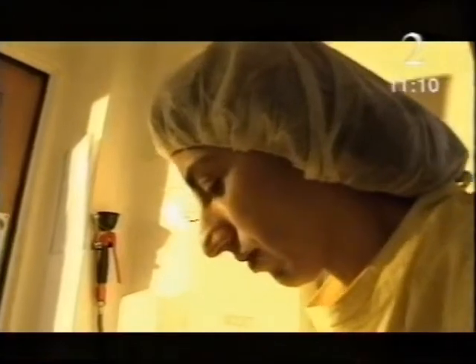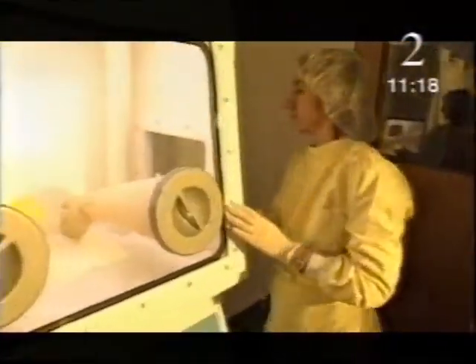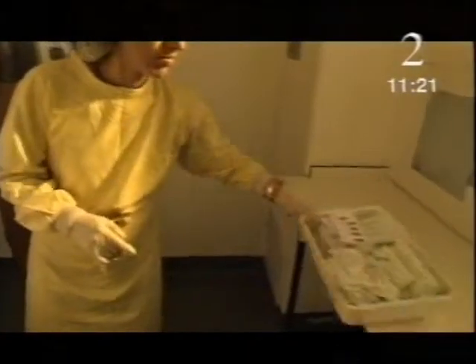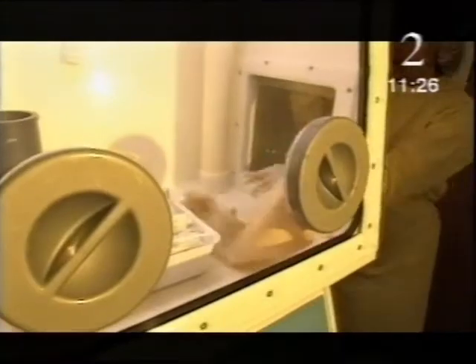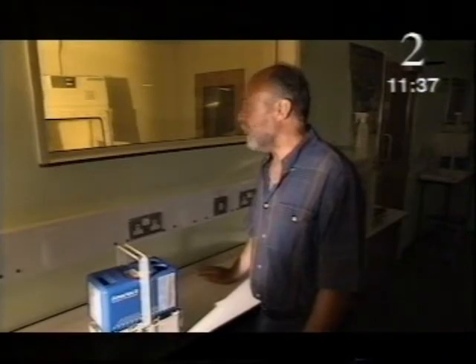Seema Mohammed Targi will make up Gavin's injection. Large doses of radiation can damage body cells, so Seema has to protect herself and make sure the radioactive material stays inside her special laboratory. Because it has to be injected into a patient, of course, it has to be sterile. And Seema's working within a sterile cell, within a clean room. You can see the rubber gloves, and they're held in position by the pressure of the air, which forces all of the dirt out of the clean environment.